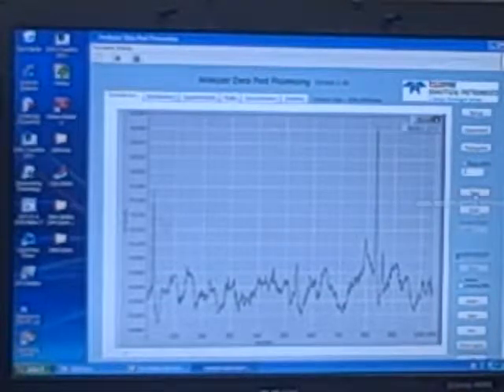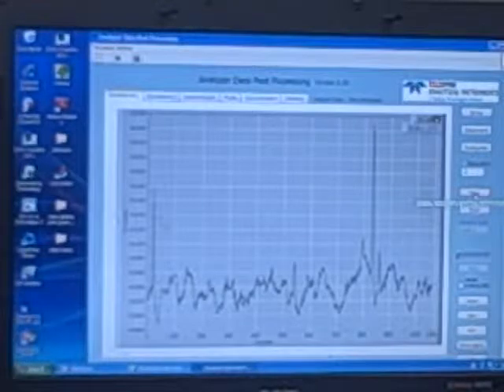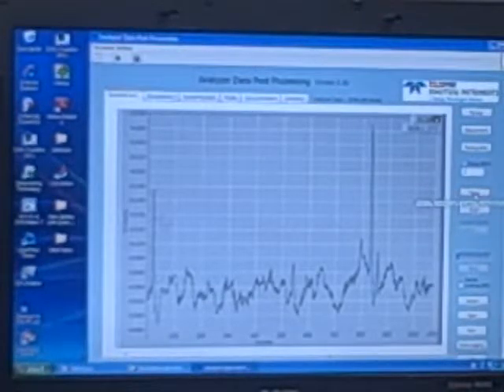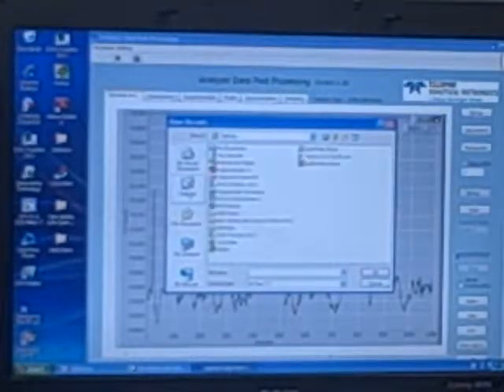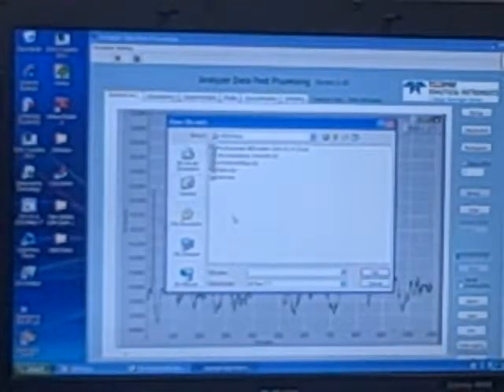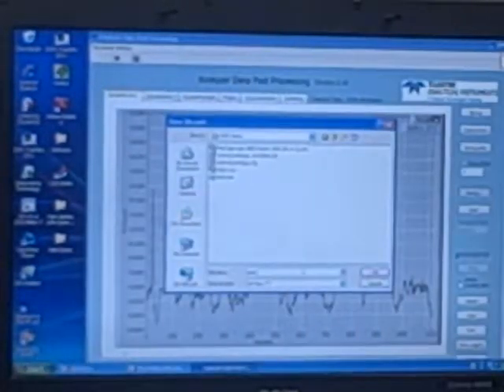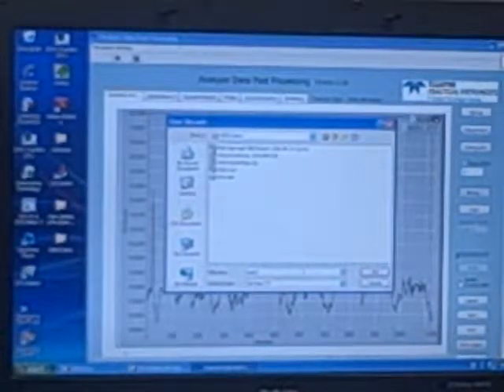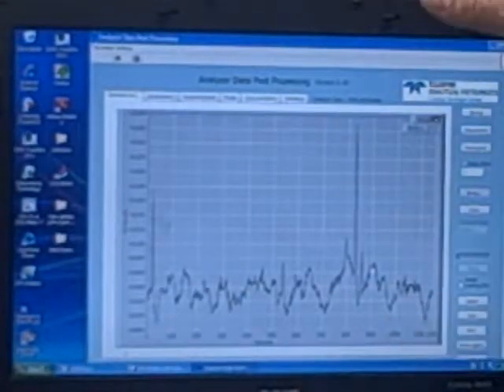Now you are ready to save. However, we don't know where you save the data. We want you to name the file and also the path. So you click save. For example, today I'm working on the desktop, in the 4060 demo folder, and I call this file name test 2. Okay, so later on I know what I'm talking about, where I saved it. You do remember the path. You click OK. So the computer is ready.